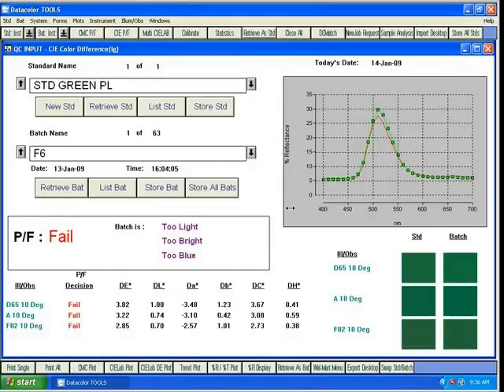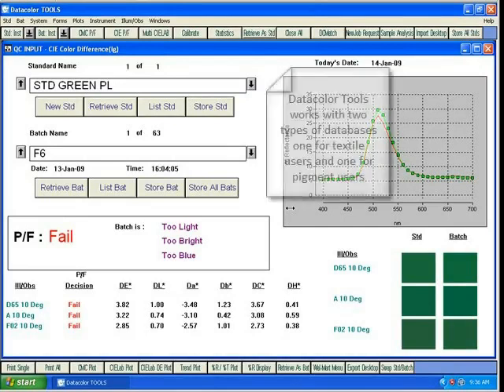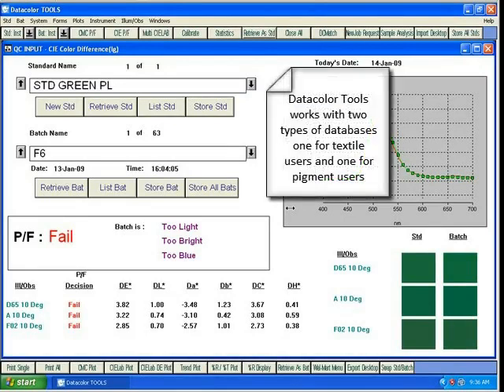We will now illustrate how to permanently store standards and batches in your database. Datacolor Tools works with two types of databases, one for textile users and one for pigment users.